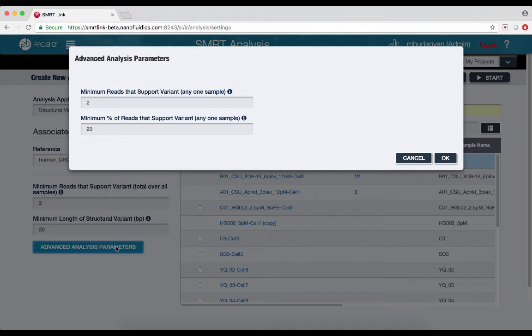In other words, at least one sample from a multi-sample run must satisfy these criteria by itself. All basic and advanced requirements must be met for a given structural variant for it to appear in the analysis output.